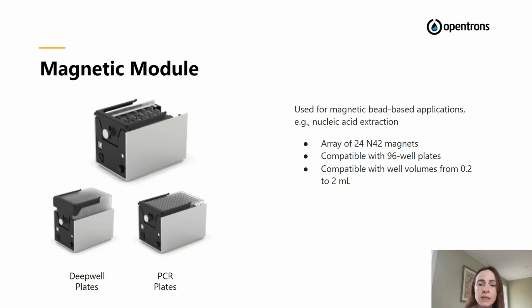It's difficult to see here, but it has an array of magnets that pop up in between the wells on a 96-well plate and engage and attract the magnetic beads, and then at the appropriate time, the magnets disengage and so on. It's a cool design for doing magnetic bead-based extractions and similar work.